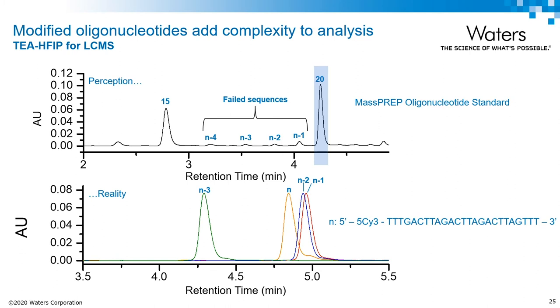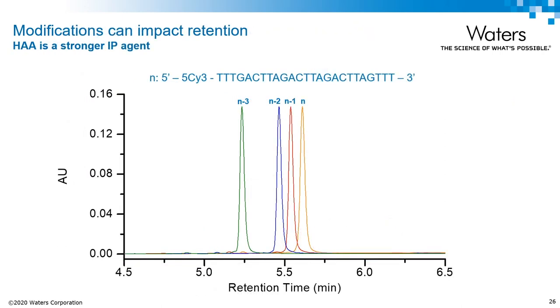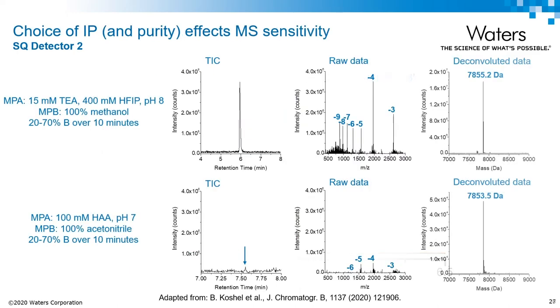Here we have a 25-mer species with a Cy3 di-conjugate, and the N-1, N-2, and N-3 impurities were all synthesized and spiked into the sample at equal amounts. In this case, we can see that the failed sequences co-elute and have a later elution time than the main peak. By using hexyl ammonium acetate, which is a stronger ion pairing agent than TEA-HFIP, the separation once again becomes length-based. Hexylamine provides more efficient ion pairing through more effective adsorption to the reverse phase stationary phase than TEA due to the length of the alkyl chain. However, the problem with using HAA in place of TEA-HFIP is that it is not MS compatible, and the same sample load is barely distinguishable from the noise in HAA.